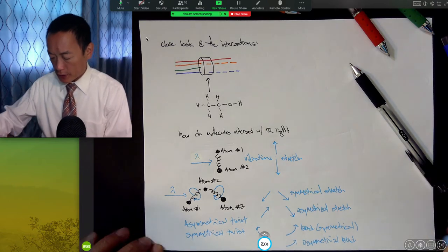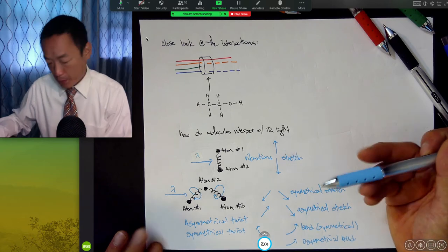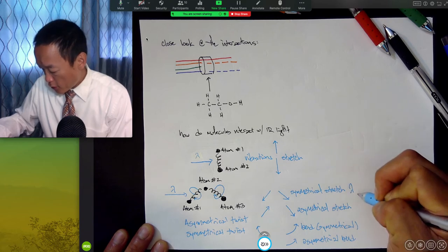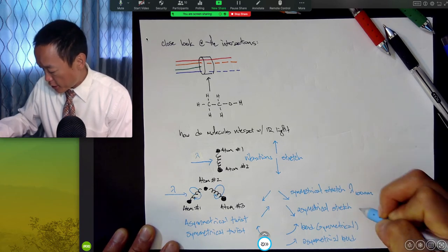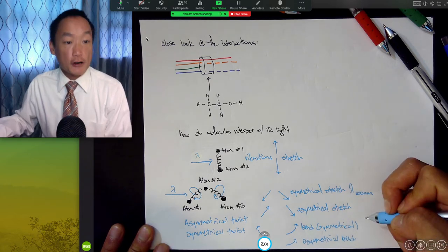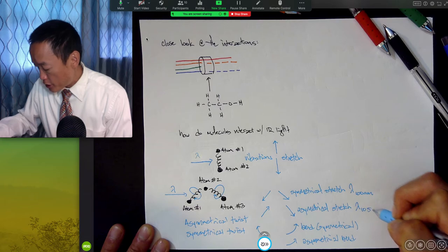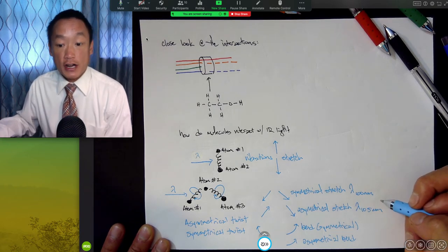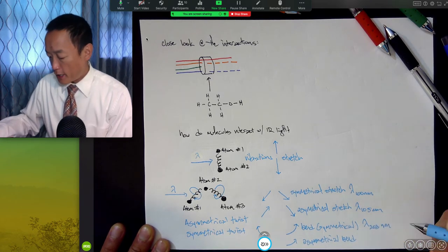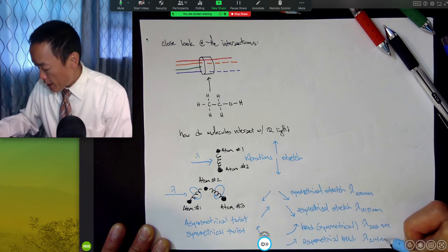And I've done kind of a disservice here because I've suggested that this one wavelength could make any of this happen, but what I would really want you to understand is that maybe this is like wavelength 100 nanometers, and this is like, and that's not even remotely close to the right wavelength. But I just want to show you that the energy required to get a symmetrical stretch would be different than the energy required to get an asymmetrical stretch, which would be different than the wavelength of a symmetrical bend, which would be different than the wavelength of an asymmetrical bend.